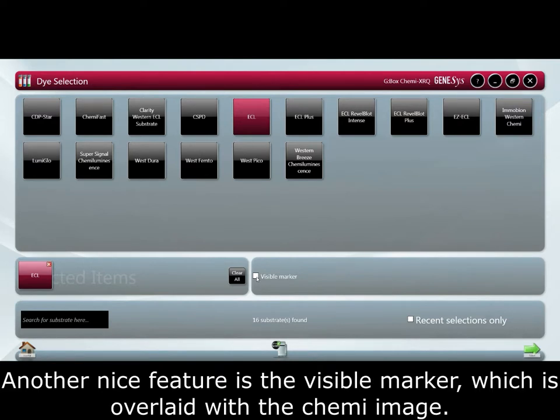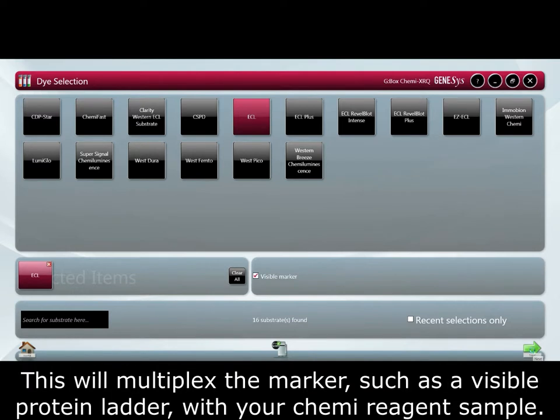Another nice feature is the visible marker which is overlaid with the chemi image. This will multiplex the marker such as a visible protein ladder with your chemi reagent sample.